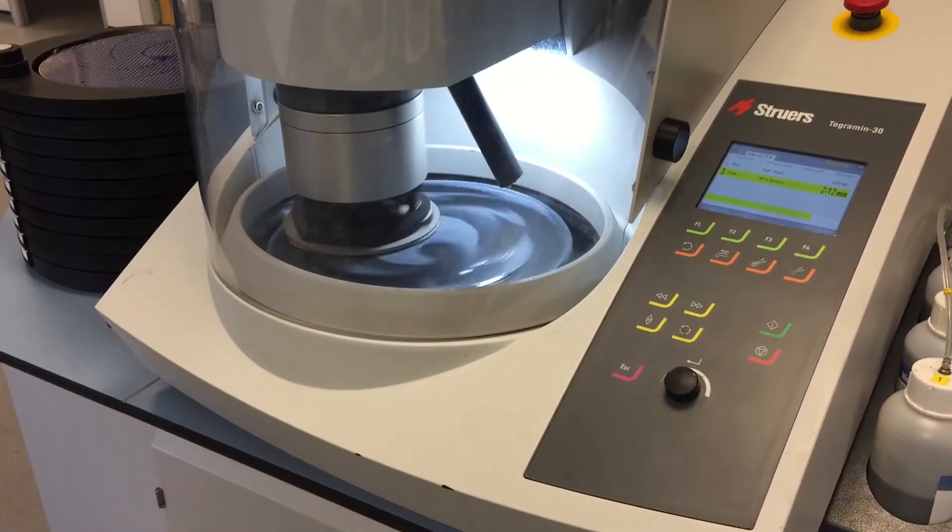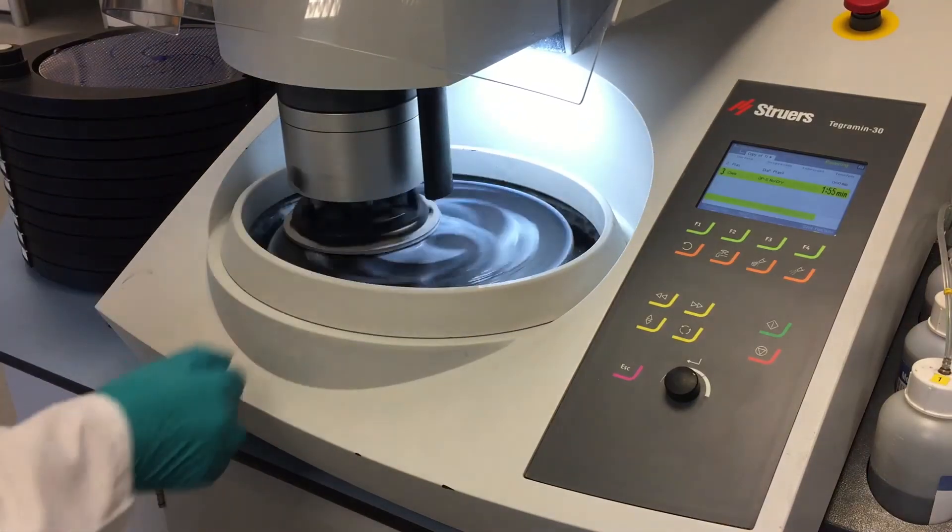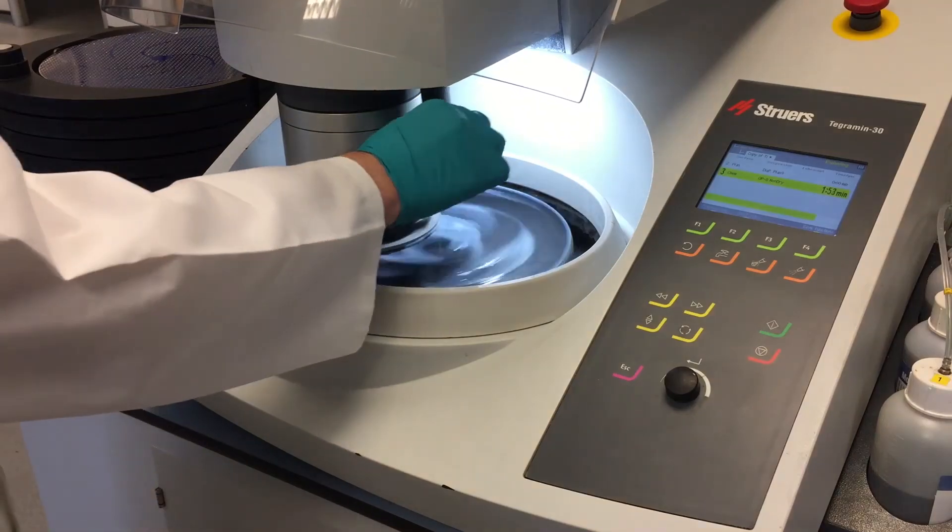Here is a little tip: when you are doing the OP-S step, make sure the dosing arm is pushed to the outside of the disc. Because as the head moves contra it pulls the samples inward, so if you have the dosing head in the middle of the cloth it won't push the suspension out to the sides. You don't want it there — you want it on the outside.